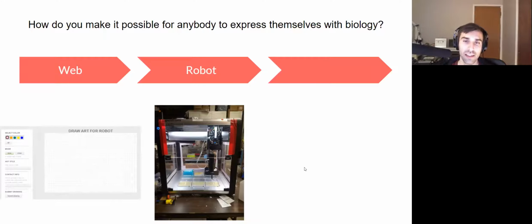But if we want to expand it and really make it something where anyone can do this, it's not just something running out of CCL. We've built it as an open source platform for that purpose. You can see I've got this little "as seen on TV" star in the bottom that says we're all open source. The reason is that it's low cost and accessible. We want to make it so that anybody can get into this.